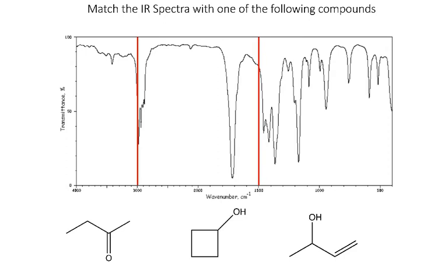All right, here's another example. There are a couple things when I'm comparing this spectrum to these compounds. First of all, I don't have a big OH peak here, so it's probably not either one of these two. And I have this nice big high intensity peak at a little over 1700 wave numbers, and this is exactly characteristic of a carbon-oxygen double bond. So based on my choices, this is almost certainly the molecule.